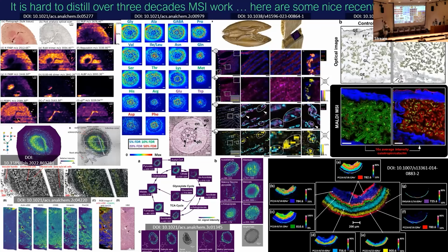There's been a lot of development also in bringing methods that you might be more familiar with, like immunohistochemistry and immunofluorescence, using those antibody-based probes. That has recently been brought into mass spectrometry imaging, where those same probes now have a photocleavable tag on them. And what we can see, if you look in the bottom left-hand corner, is very diverse multiplex detection, because mass spectrometry is really good at detecting several hundred species at the same time, unlike a lot of the microscopes, which might be limited to, say, 3 channels, or a couple more if you use some advanced methods.